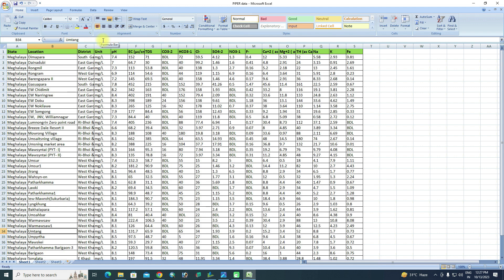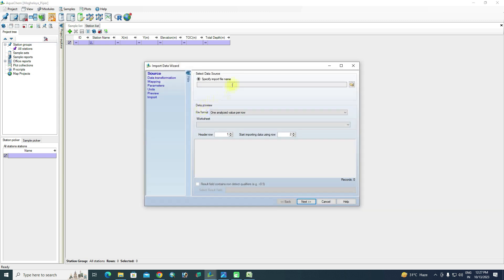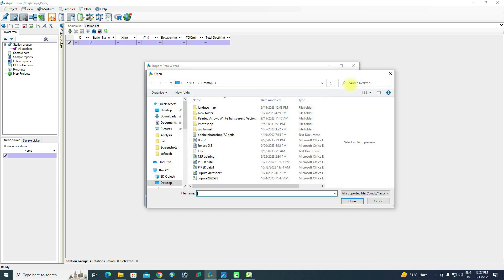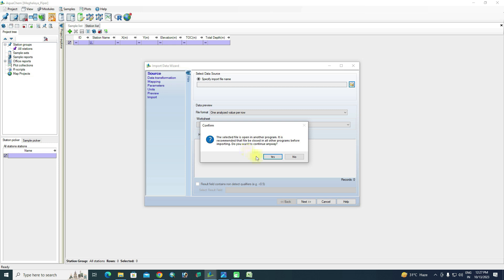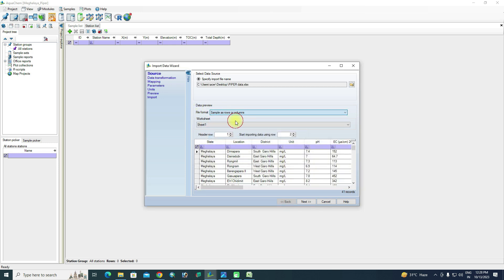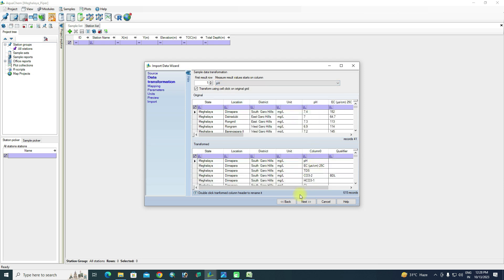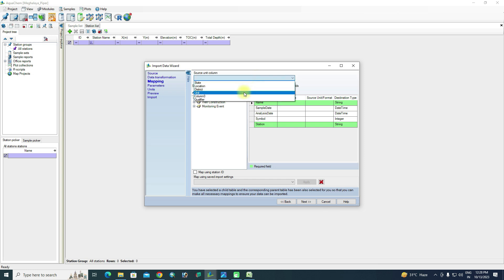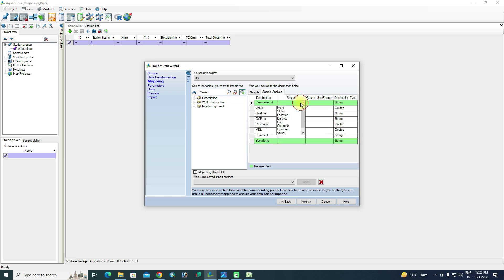Save the updated Excel file and reopen AquaChem. Go to Import Data again, click OK, then browse for the file — it is named 'PIPER data' on the desktop. Select it and open. Set format to rows and columns, click Next. Set measured results to start from pH, then set the unit column, source as location, and station as district. For sample analysis, set parameter ID to column zero and sample ID to location, then click Next.